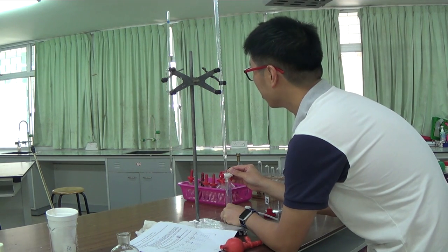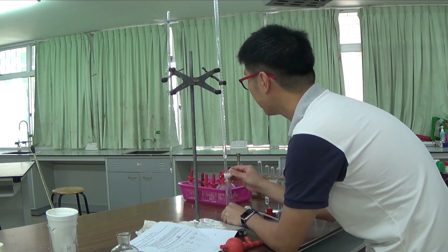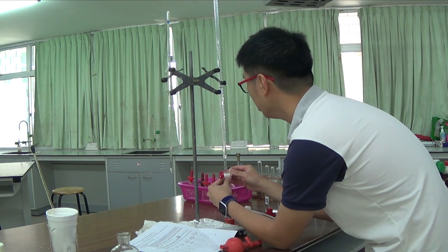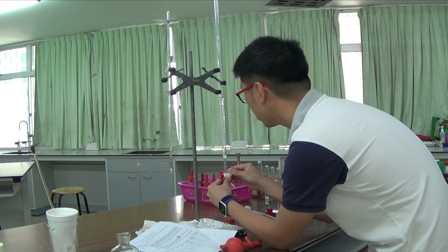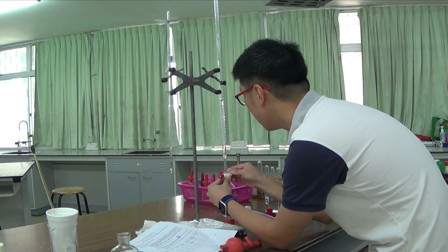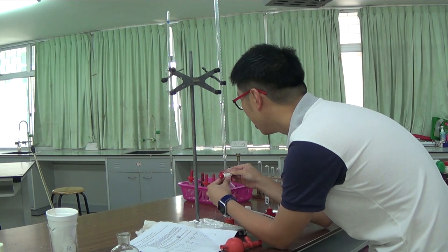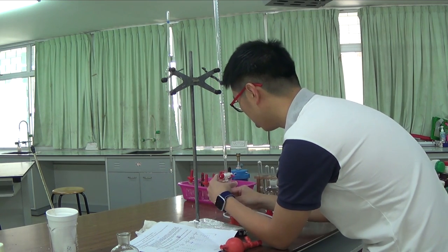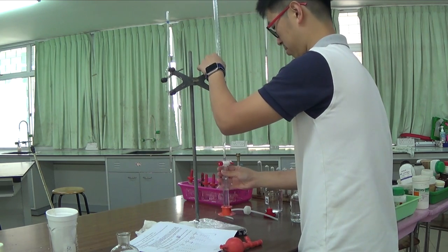So these are the kind of things, right? That's why practical is very important, because I say it teaches you to be patient, to follow strict procedures, as well as to read instructions, thinking about stuff as you are doing, in high coordination. So let's go to 38 now. And that's 38.00. So I reach the volume that I need.